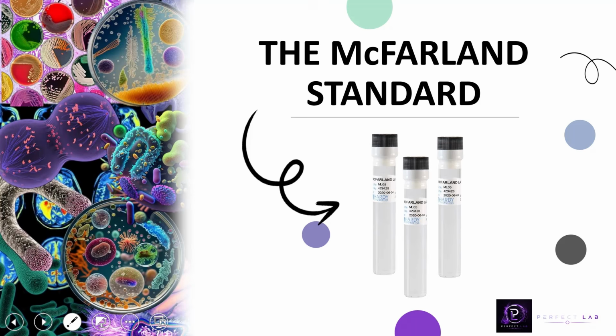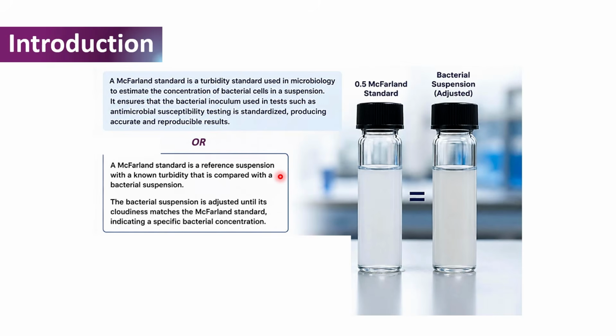So let's get started. We define the McFarland standard as a turbidity standard which is used in microbiology to estimate the concentration of bacterial cells in a suspension, and this is done to ensure that the bacterial inoculum, which is used in tests such as antimicrobial susceptibility testing, is standardized in order to produce accurate and reproducible results.